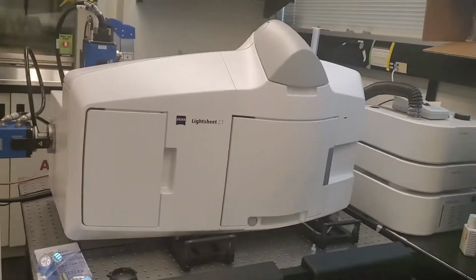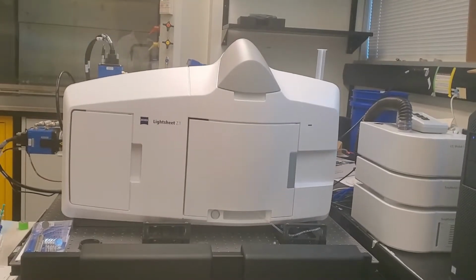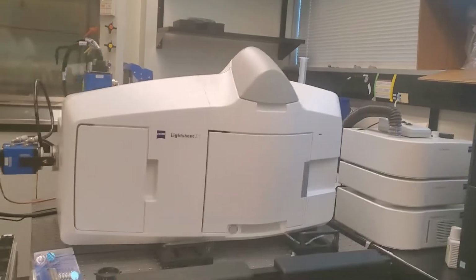For our analysis of genetically normal and NOSIP mutant mice, we want to compare their face shape, facial cell division, and facial cell death at different times throughout development. To be able to do this, we need imaging tools that can help us capture developing embryos in both 2D and 3D with high resolution and ideally in a relatively short amount of time. Fortunately for us, light sheet microscopy addresses these needs.